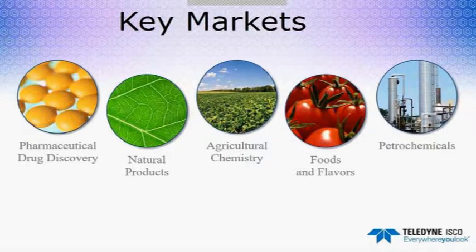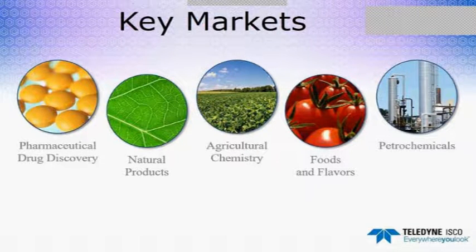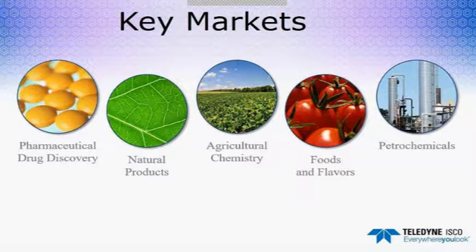Another question is about synthesizing isoquinoline alkaloids, and the question is, would I recommend the amine column? It is something that you can certainly try. Instead of buying the column initially, you can purchase some TLC plates to see if the amine functionality will work for you, and see if the resolution is improved. And you can also try different solvents on the TLC plates.